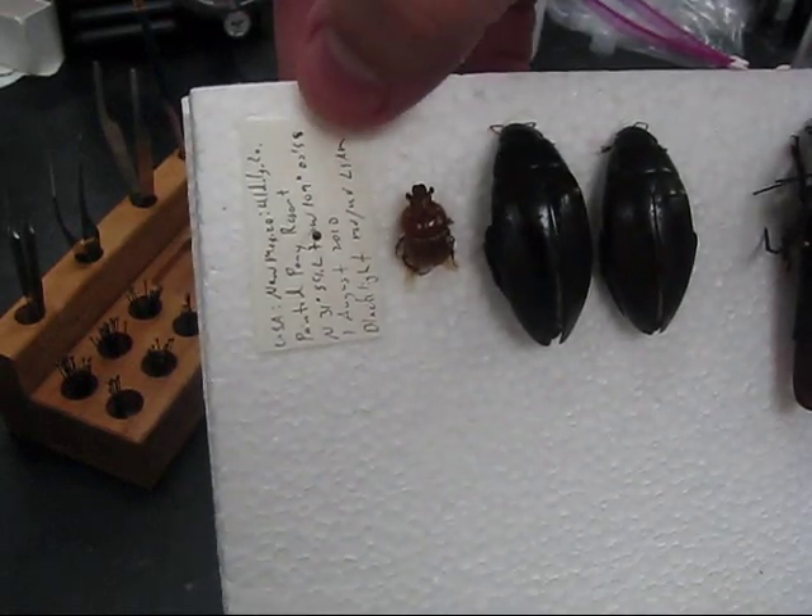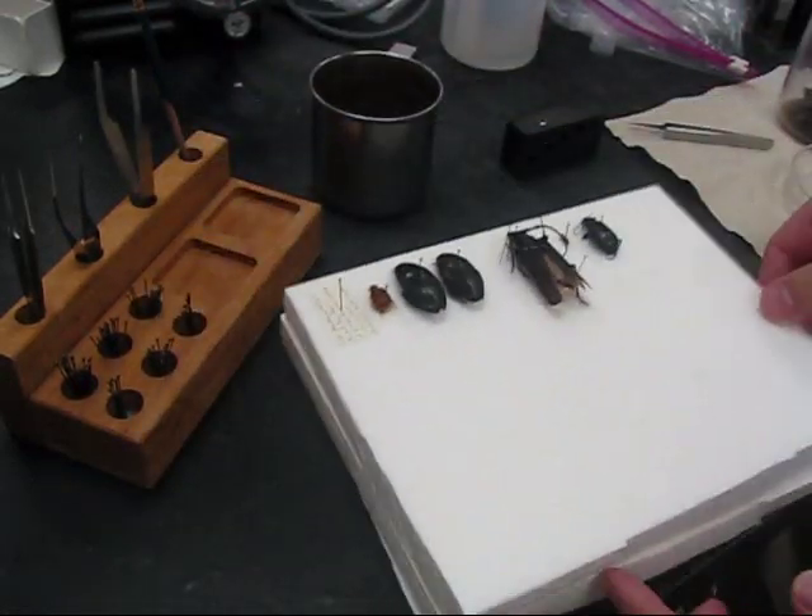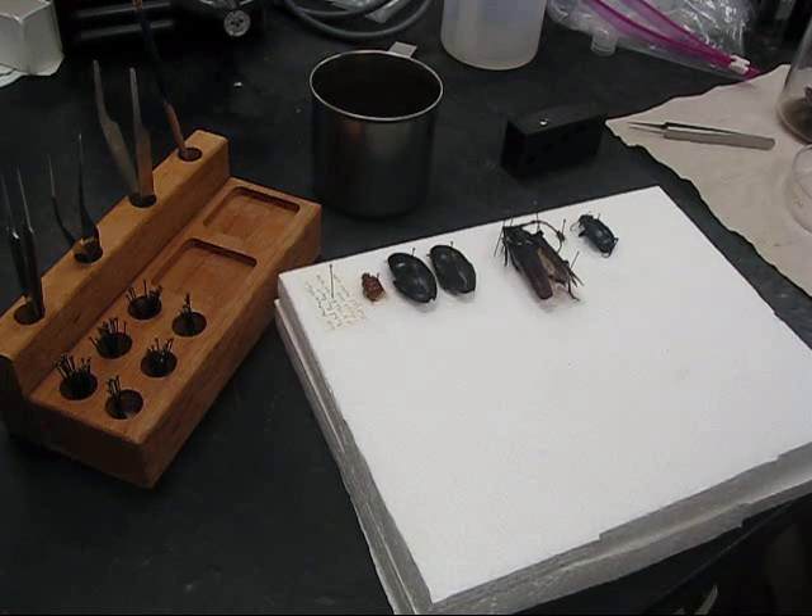Always, always, always label your specimens. And that's how you pin an insect.